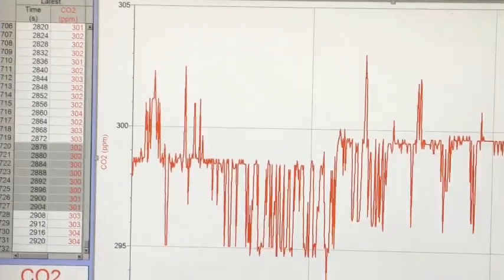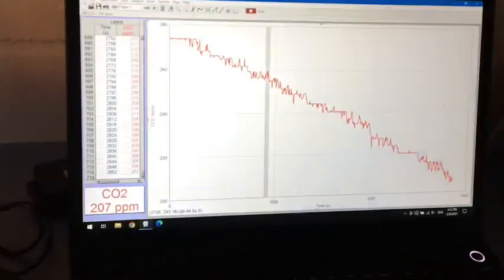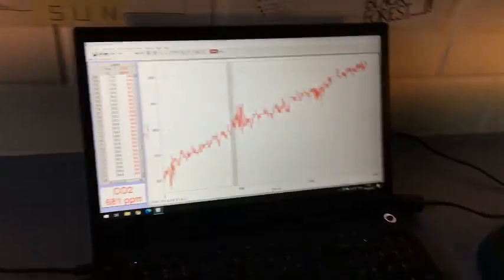All right, red filter, normal filter, you have a decrease with the red. With the green, you really have hardly anything. It's like 5 parts per million, whereas this one with the red was 80 parts per million. Here you have about an 80 parts per million increase with the blue light, which was unexpected.